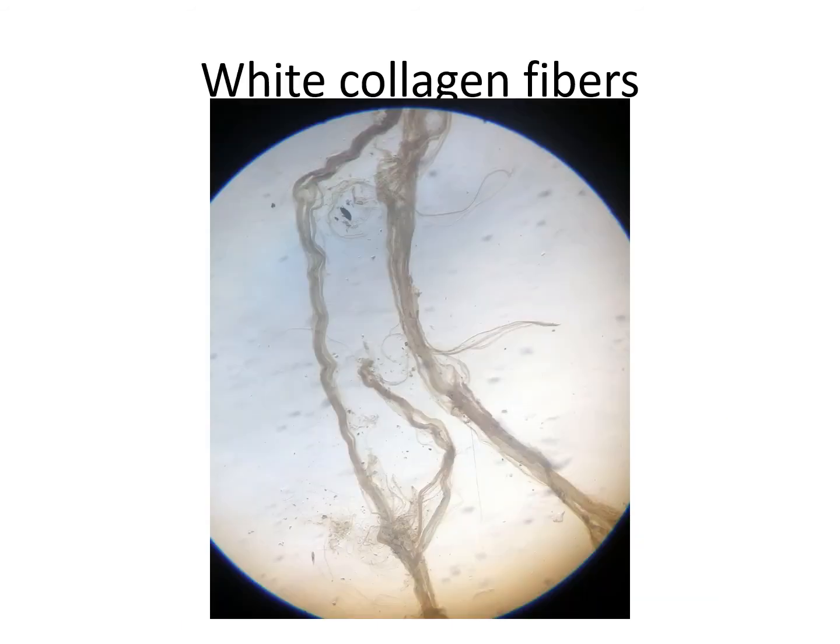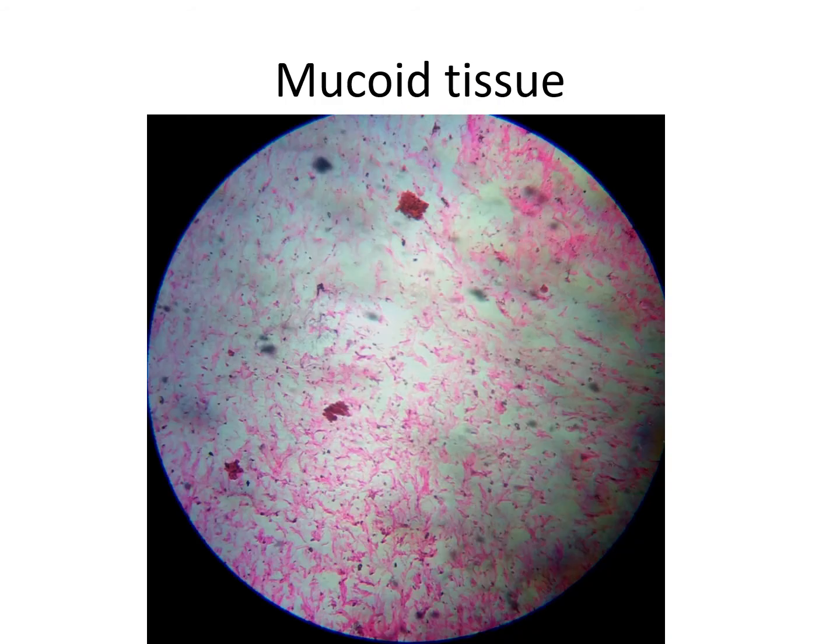This white structure indicates the white collagen fibers. Here you can see the brown stain of these collagen fibers in bundles by the silver impregnated method or AgNO3 method. These are the thick collagen fibers, given the name white collagen fibers, and not seen in the H&E stain.